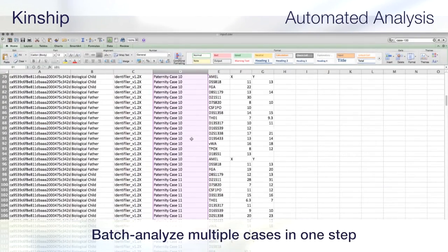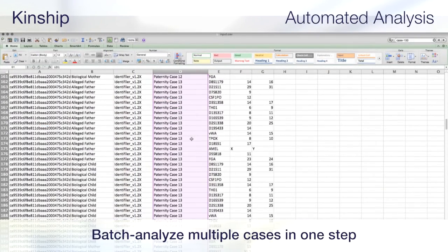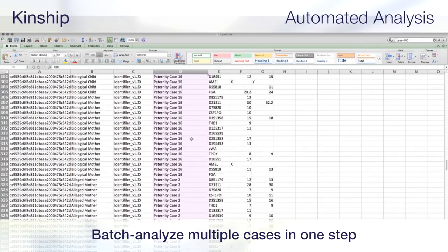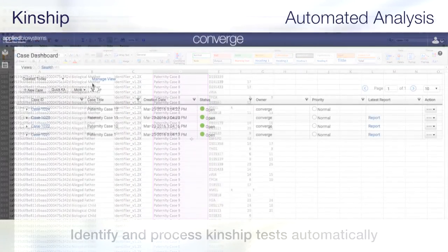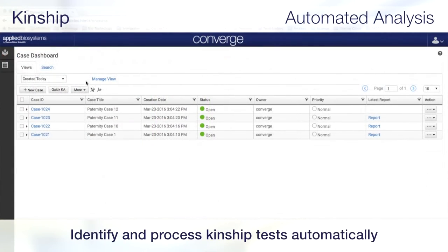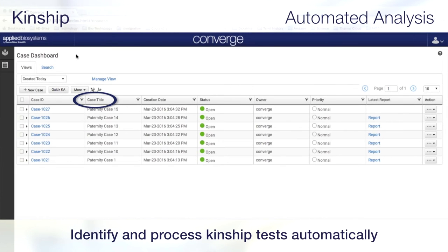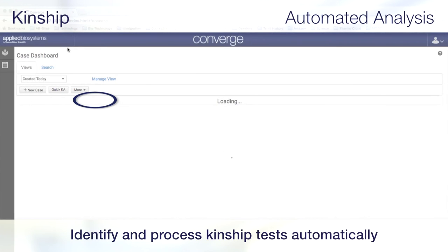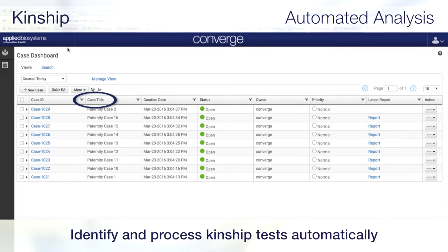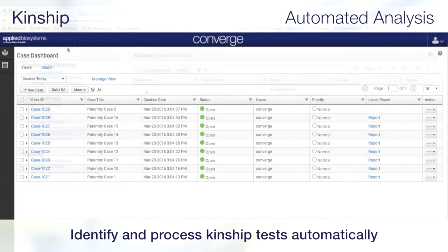Converge Software allows you to batch analyze multiple cases in one step. The software identifies and processes trio paternity, trio maternity, duo fatherless, and duo motherless kinship tests by automatically creating cases, adding subjects and profiles, running analyses and generating reports.